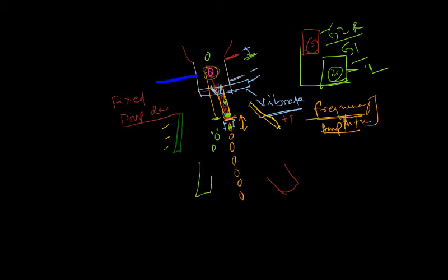So they deflect towards the negative voltage plate, and then they are collected separately. For example, there is a green cell, followed by a red cell. So what will happen? The moment the red cell is also tracked, the moment the red cell is reaching the edge of the stream, the stream is neutralized.